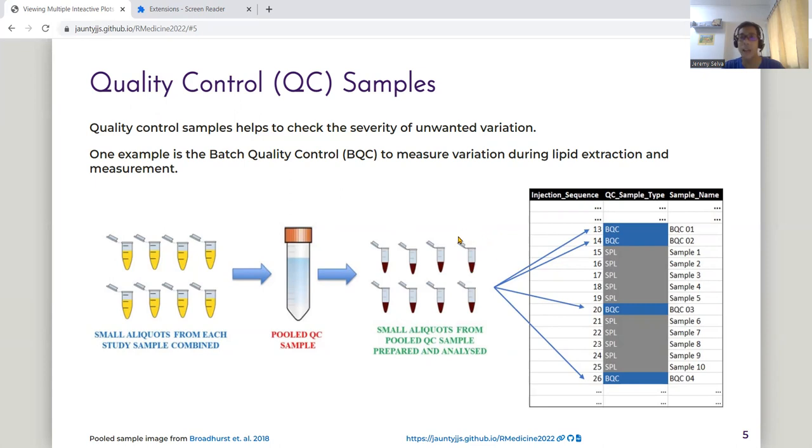These little aliquots here are the BQCs. They can be placed before the first sample, at regular intervals in between the samples, as well as after the last samples.